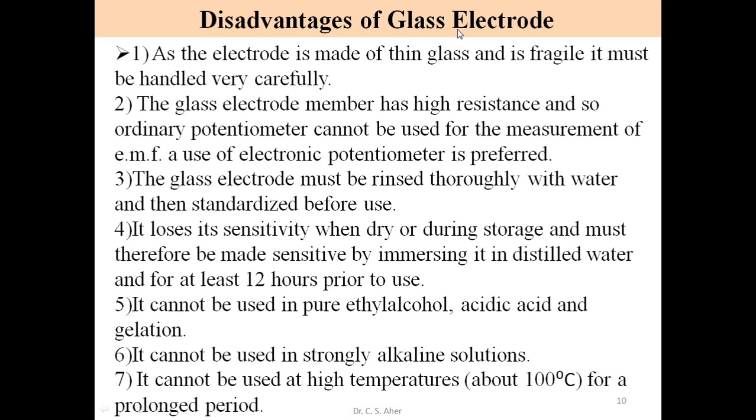What are the disadvantages of the glass electrode? See one by one. This glass electrode is made of a thin glass. Just now we saw this thin glass is there, very thin, and because of its fragility, it must be handled very carefully.